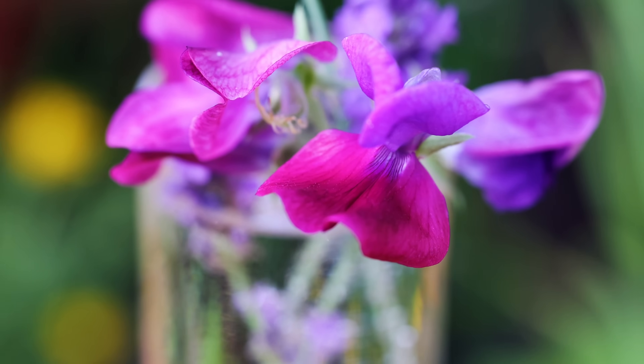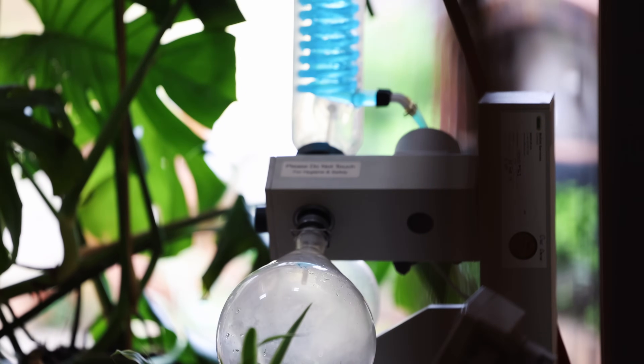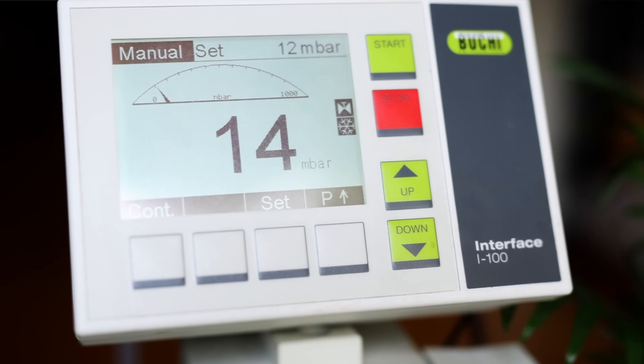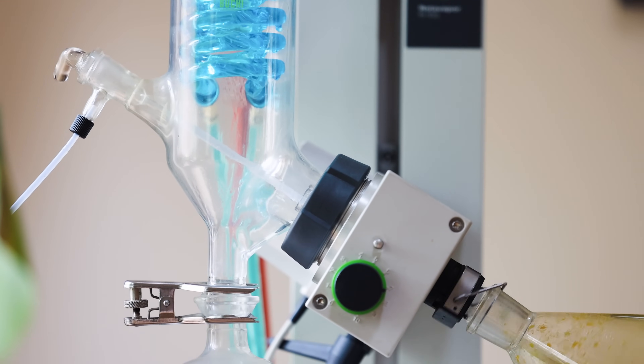While I love my Rotavap and don't like to concentrate on the negatives, let's skim over some cons before we finish. The biggest thing has to be the expense — there's just no way of getting around the fact that this is a really expensive piece of equipment. You can't have the Rotavap in isolation; you do need the chiller, vacuum pump, and controller along with it, and to get all of those together with VAT it's going to cost about seven thousand pounds to get set up with just the base level Buki Rotavap like mine. I could only get mine at all because of a one-off consulting gig I did.